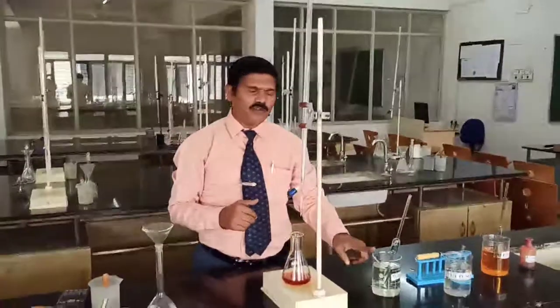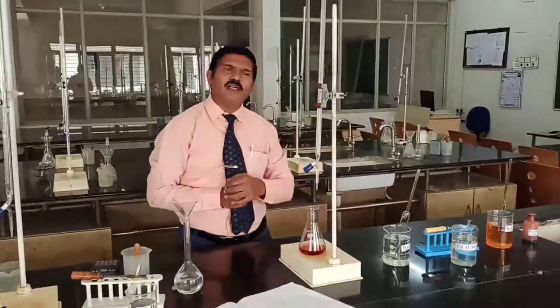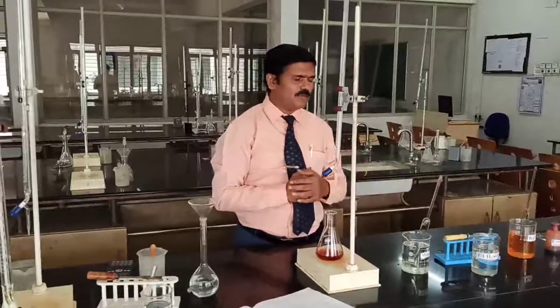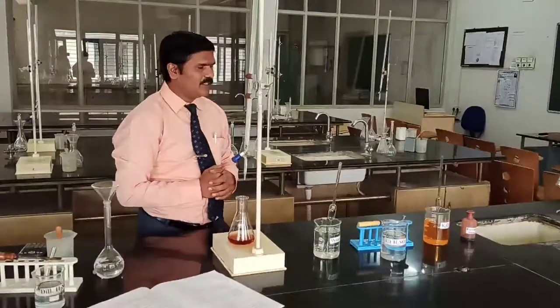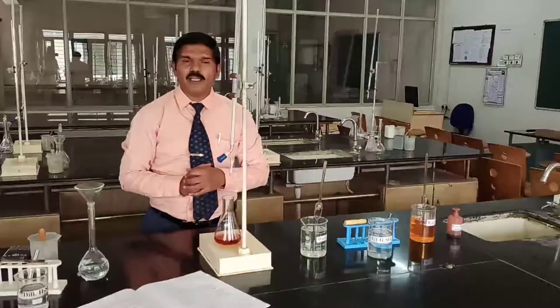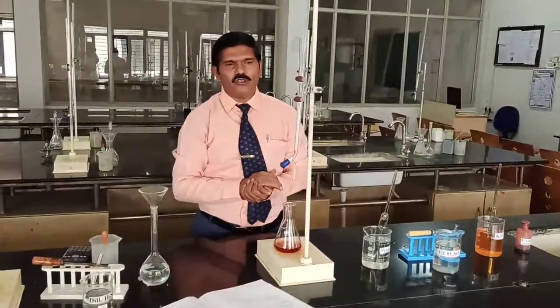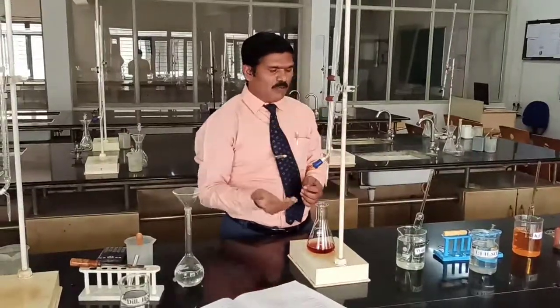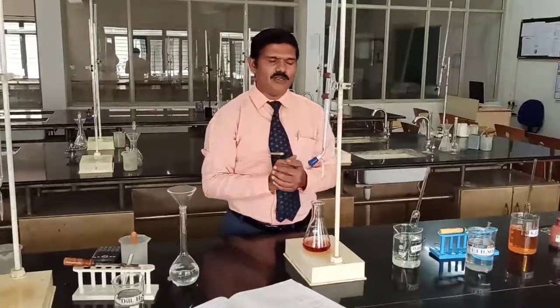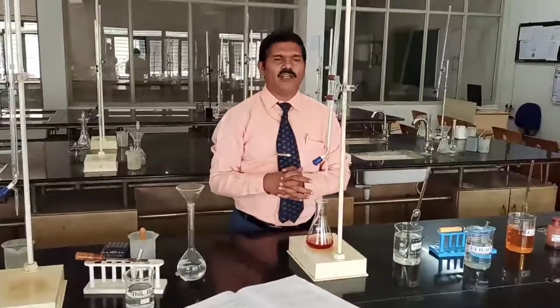We also have to perform one blank titration. For the blank titration, instead of industrial waste water, we take 25 cm³ of distilled water, then add the same 1:1 sulphuric acid, 10 cm³ of K₂Cr₂O₇ solution, and 2 to 3 drops of ferroin indicator. We titrate in the same way to find how much potassium dichromate is consumed. Usually, potassium dichromate consumed in the blank titration will be more than in the sample titration.